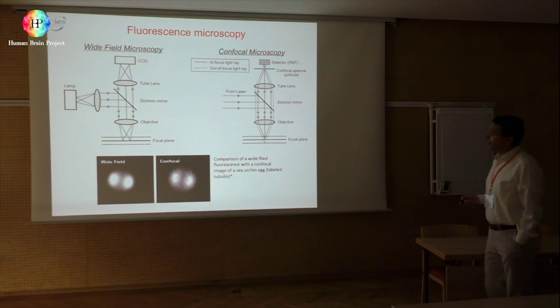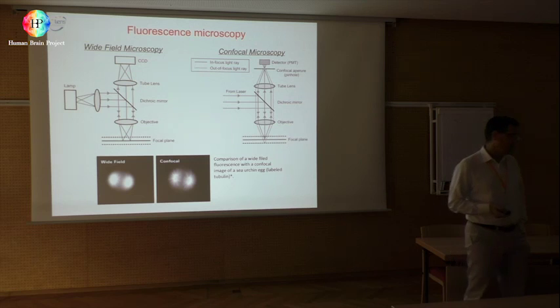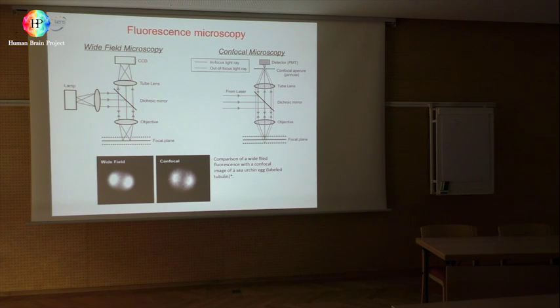Now, as you probably know, the possibility to increase the resolution, at least in the Z direction, the axial direction, comes from confocal microscopy.